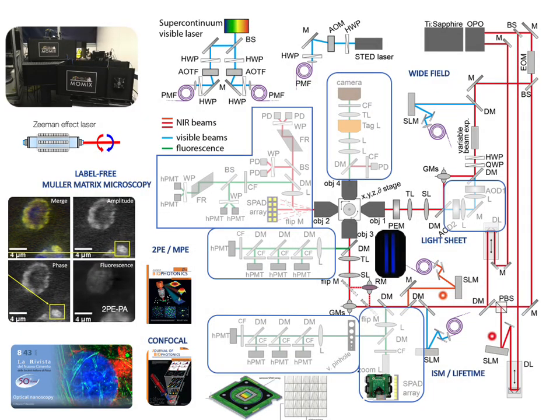And now I bring to you this rather complicated architecture. It's complicated because it contains everything you have seen before in terms of imaging, now in terms of components. So in the central part is the sample. You can perform selective plane illumination. You can perform lifetime. You can perform two-photon excitation, STED, single molecule. You can use supercontinuum white light lasers. You have so many instruments at your disposal that you can start thinking to put everything together in order to be able to tune your microscope when you have a specific question.